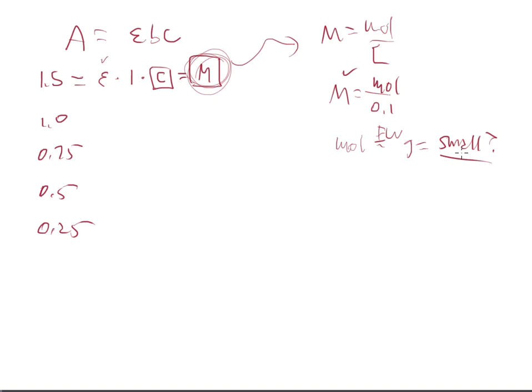When we make a more concentrated version, it's very easy to shift the decimal over once and make it 10 times too strong, and then go to a 1 to 10 mil dilution in order to get this very highest standard that I would start with. All right, so again, I'm going to leave that up to you. You make those judgment calls. You call the shots on the standard prep, but that is the process that we go through in the very beginning.